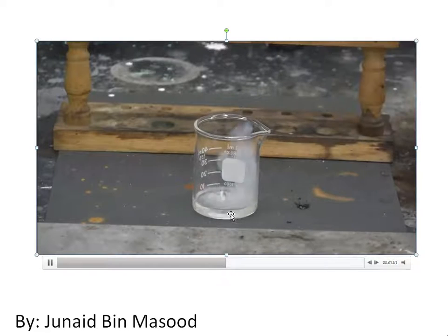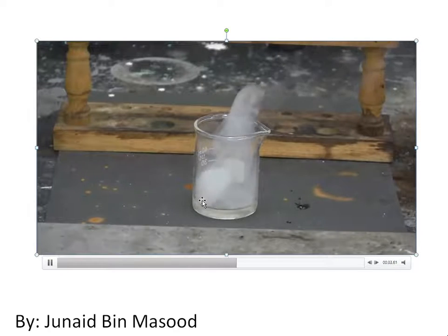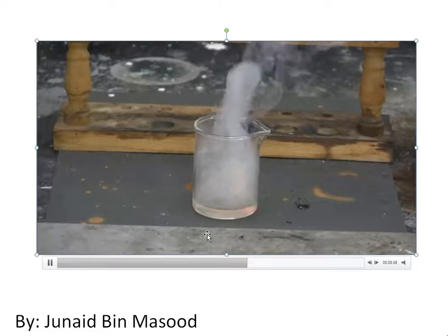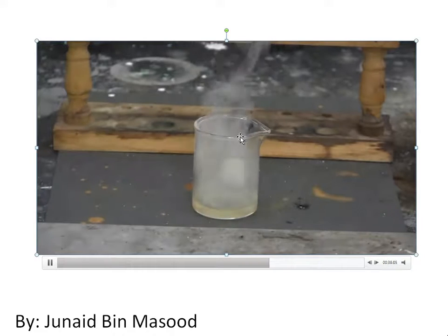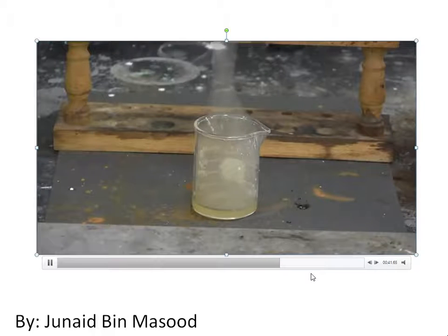So when we put it in the acid, look at this. This is the reaction taking place. See? This is the reaction. It's a burning, explosive reaction, and a lot of heat is released. That is why you must not try it at home.